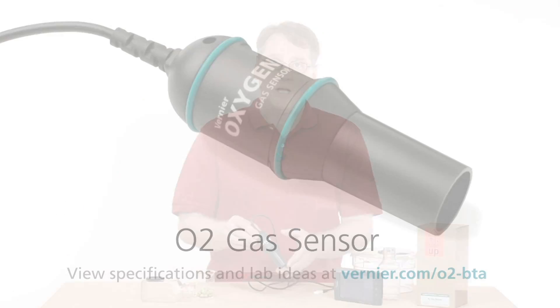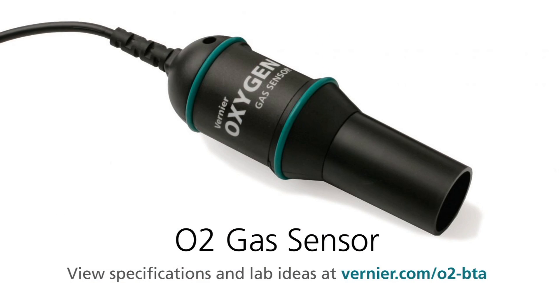This is the oxygen gas sensor. It's used in several of our lab books. It's used extensively in our biology series.